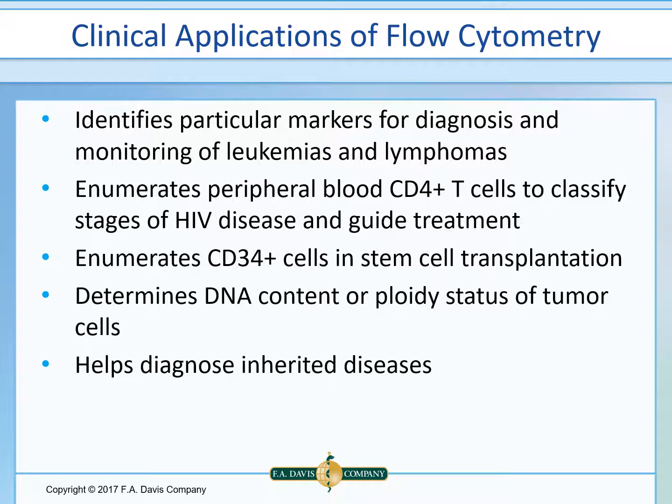With some of these X-linked and autosomal recessive diseases in which neutrophils are defective in their oxidative bursts, flow cytometry is used to expose the neutrophils to a dye which is not fluorescent until oxidized. When normal neutrophils are stimulated in vitro, the dye is oxidized and becomes intensely fluorescent. Neutrophils of patients with these inherited diseases are unable to oxidize the dye and do not become fluorescent after stimulation.